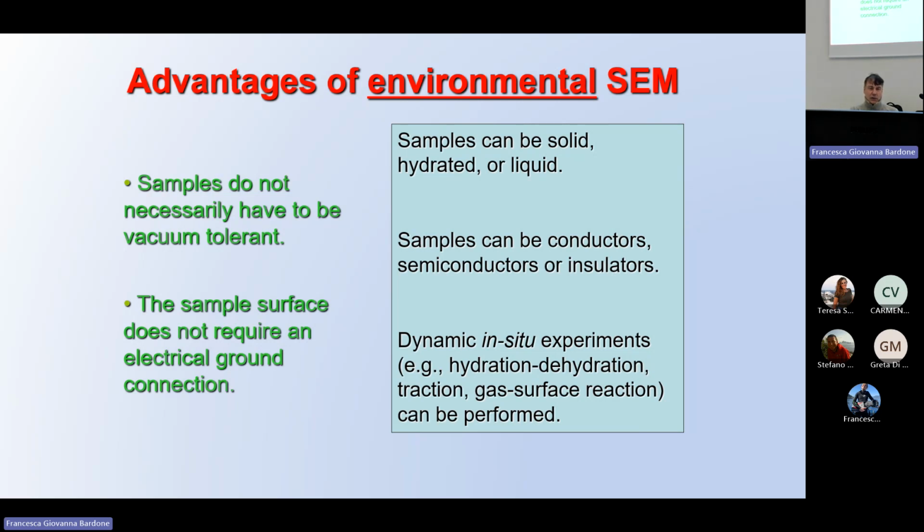And also this extends to dynamic in situ experiments. Since you don't have to prepare in any way your material, you can do whatever you want. You can make mechanical test, tensile test, compression test, whatever, because your sample is not prepared in any way.